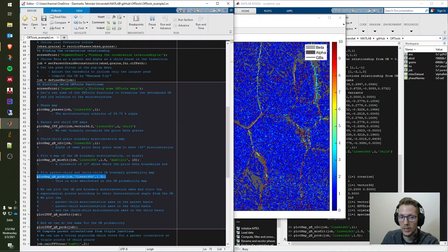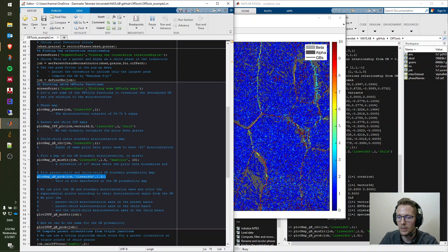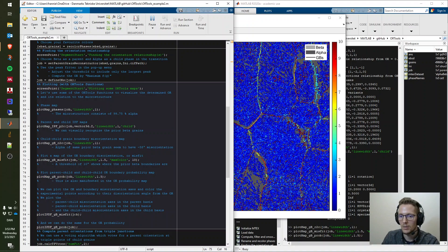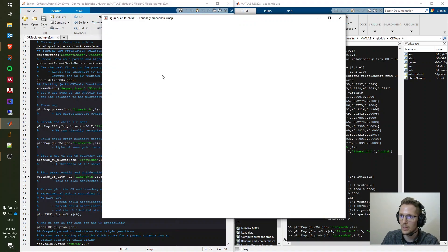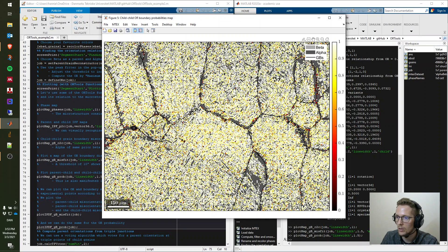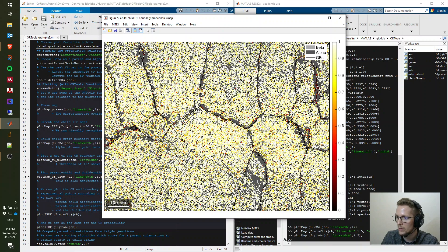As in the previous example, we also plot the grain boundary probability map, which shows the probability that a boundary belongs to the orientation relationship. Extra parameters can define this probability differently. The grains inside the apparent beta grains are quite bright, indicating a high likelihood of belonging to the OR, while the prior beta boundaries show a low likelihood.